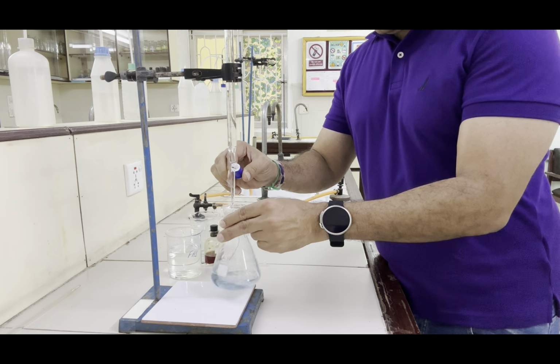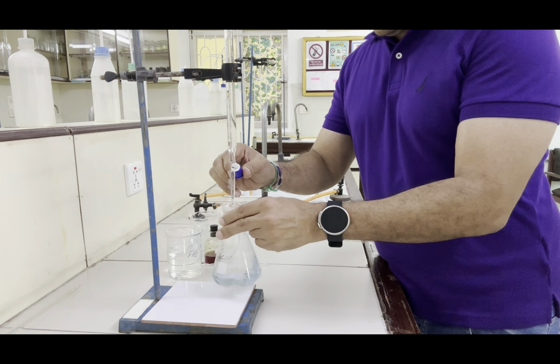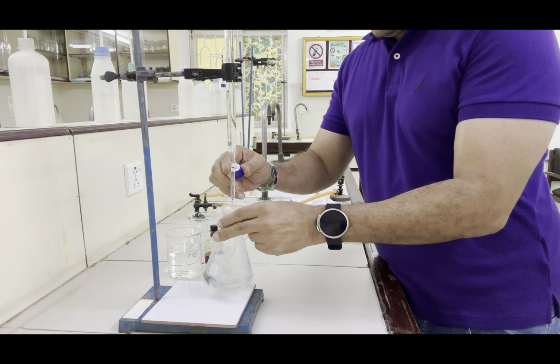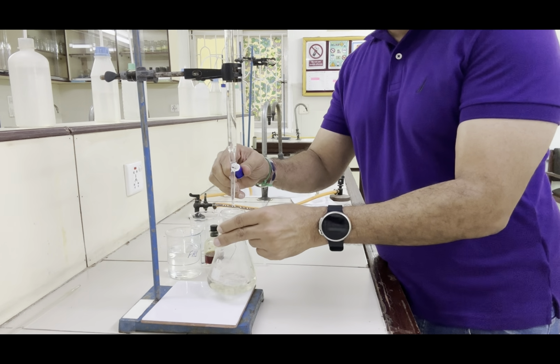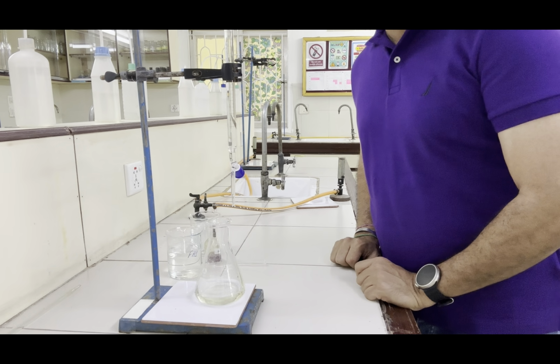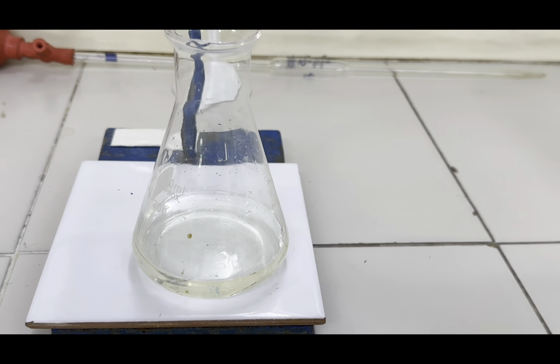No, it's not yet yellow. Now we can see the solution is completely yellow. We have stopped. This is our rough titration. Now this is the yellow solution where I have stopped adding Fa1.